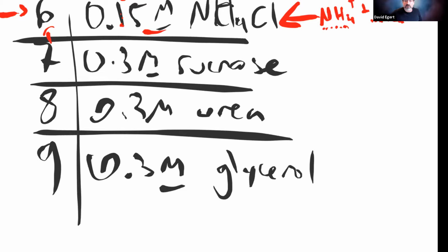So if I was originally making a hypothesis for this without having more information, I would say, I suspect this would be isotonic, right? Because it's kind of ions.